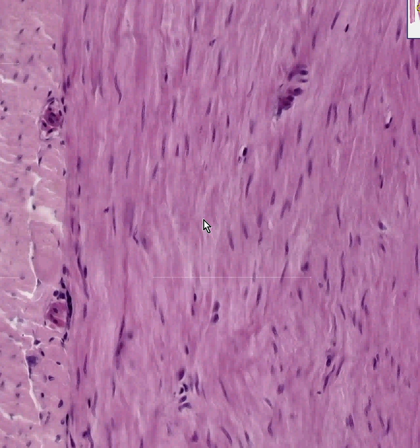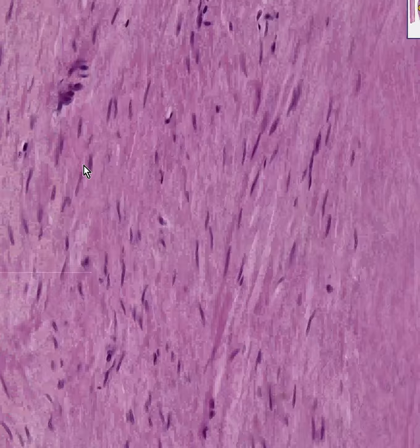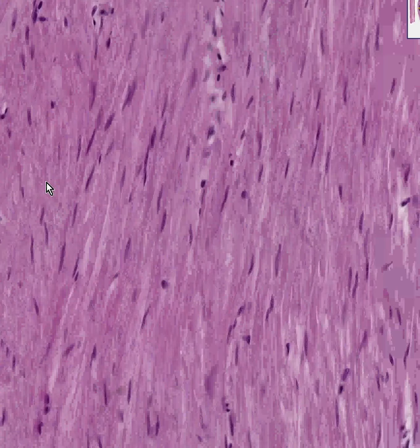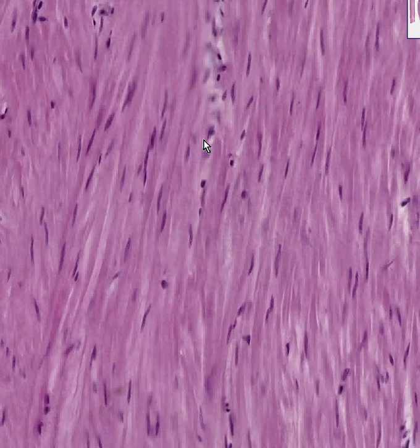But if you did a trichrome stain, the cytoplasm of the fibroblasts and the collagen fibers stain very clearly blue or greenish blue, whereas smooth muscle would not pick up the greenish at all.